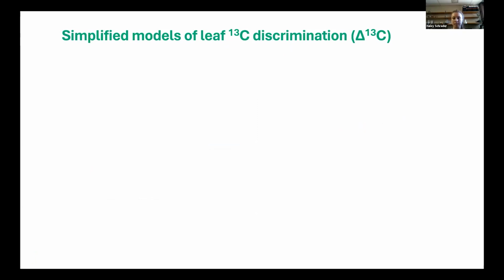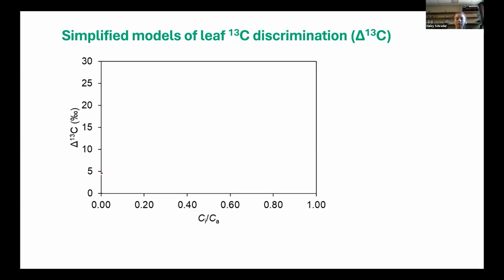So to test the LI-6878 compared to theoretical values and previous data from other systems, we can plot the discrimination that we collect, big delta 13C, versus Ci over Ca. And I just want to introduce this figure because it shows how we'll use these variables to represent our data in the coming slides. So the Ci over Ca tells us the ratio of intercellular CO2 to ambient CO2 for the leaf.